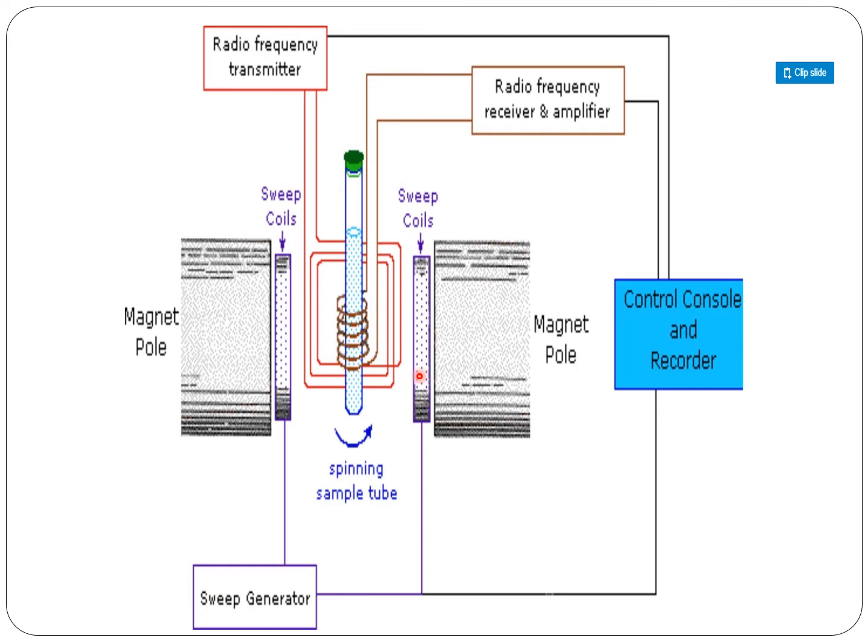constant. The radio frequency is continuously increased or decreased, continuously passed through this sample holder. That means the radio frequency should match the nuclei which are present in this sample, such that we continuously change the radio frequency. Each time it matches, the sample response will be recorded in this amplifier, and we get the graph. So this is the basic experimental procedure of the continuous wave NMR.